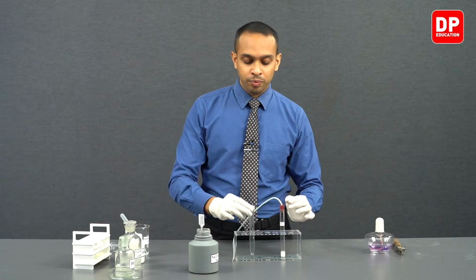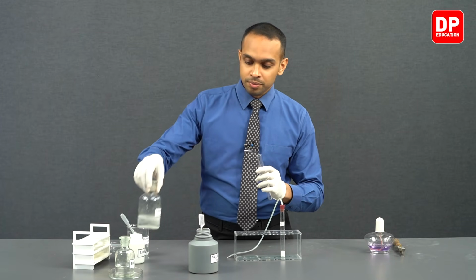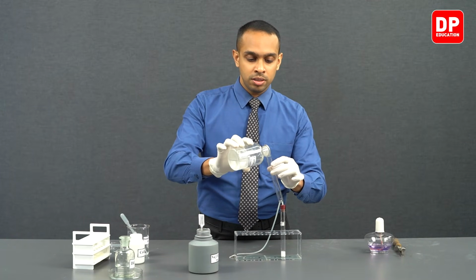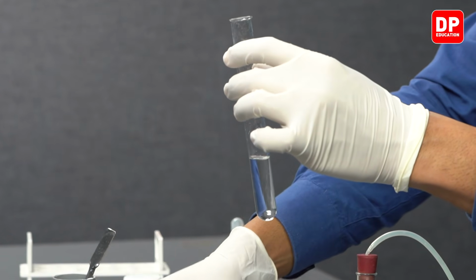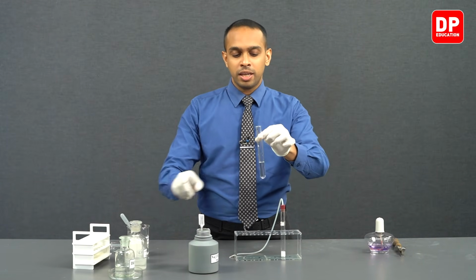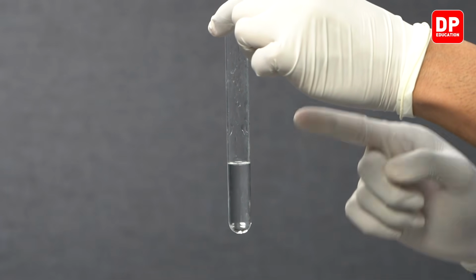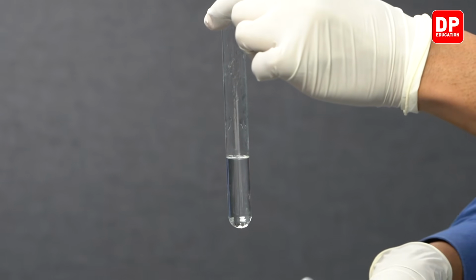So we have to take lime water to this test tube that we have here. We have our lime water solution here. Let's take a small sample of lime water to this test tube. As you can see, lime water is a clear solution. It is not in any way a milky solution. It is a clear solution. So when we send carbon dioxide through this, you will observe this lime water turning milky.